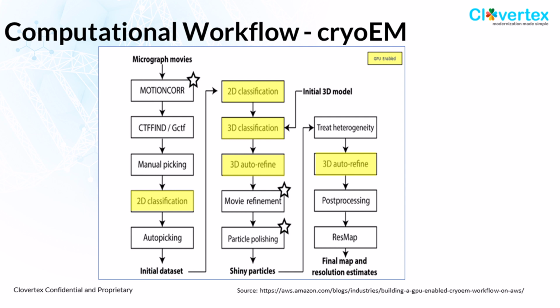This is from the software called RELION, and this is a typically used protocol, the simplest, but it works. As you can see, there are many steps, at least a dozen.